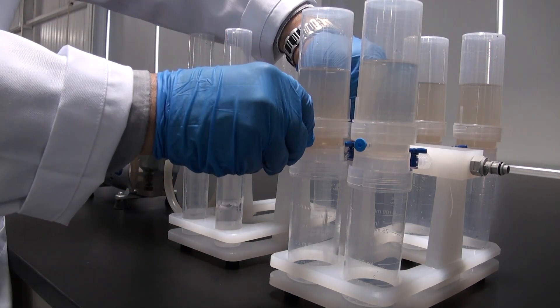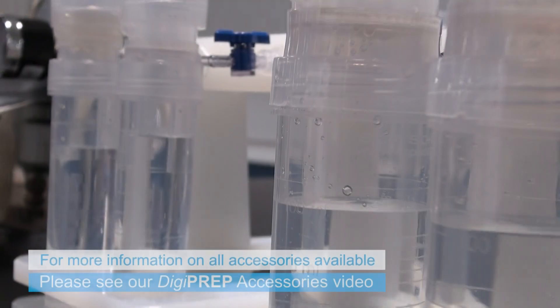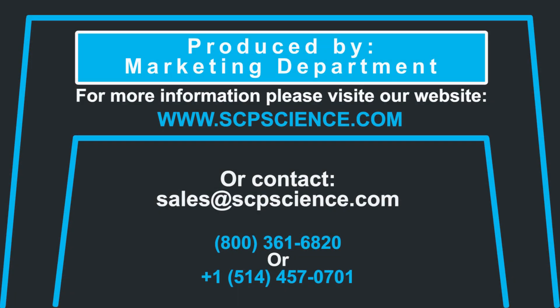one for 50 milliliter tubes and one for 100 milliliter tubes.